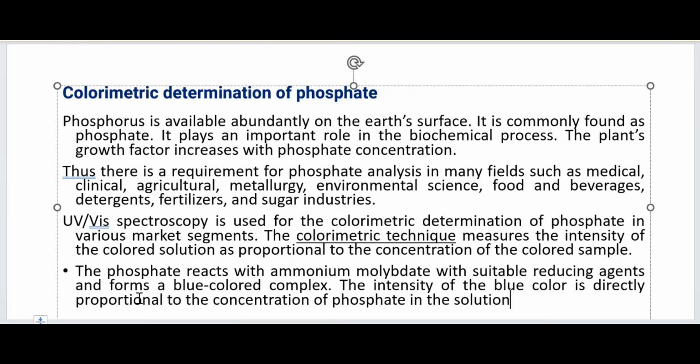It is not in depth, because when you say in depth, you have to start with the details of the spectra, then the atomic levels, the energy levels of the analyte, their molecular rearrangements, and what exactly happens with its spectral and energy absorbance, that is light absorbance, how it changes. Example to example also we can go. It's really a very special subject, as spectroscopy itself is a subject.